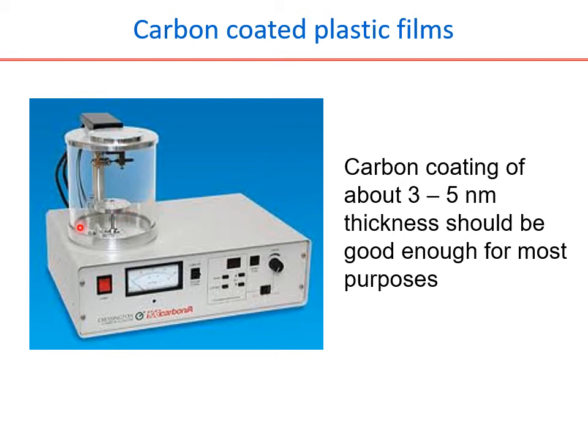You need to clean up everything so that it will be useful for the next user, who knows, the next user may be you yourself. So instead of cleaning at the beginning, it is always better to clean at the end of the experiment, so that the next user will start his experiment with a smiley face. So that's about the carbon films.